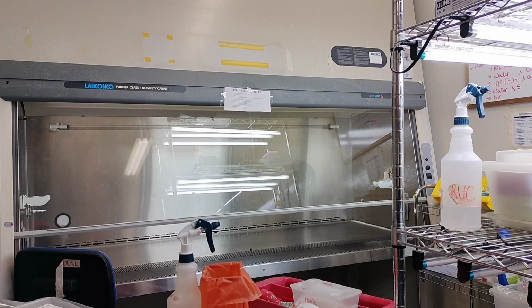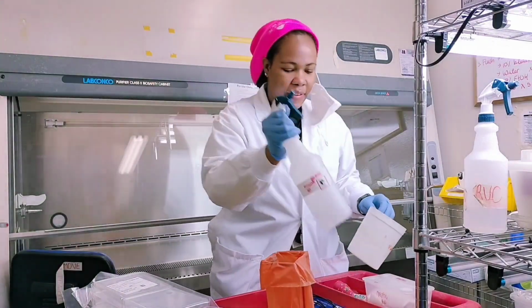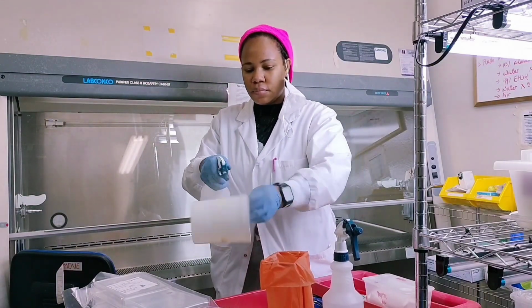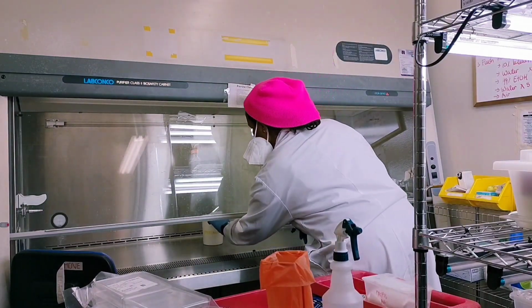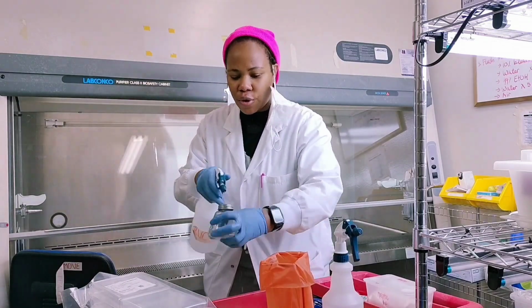I let it stabilize for 2 minutes and then I load it. I'll spray everything down with 70% ethanol before I put it in. I try to use one motion so I don't disrupt the airflow.